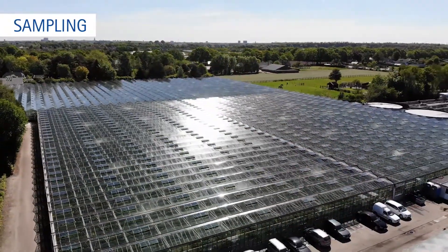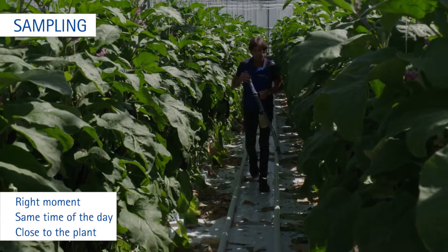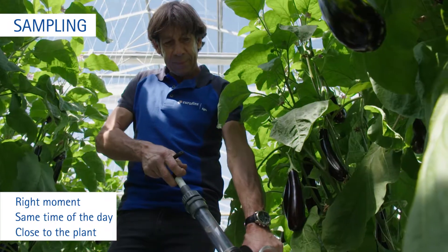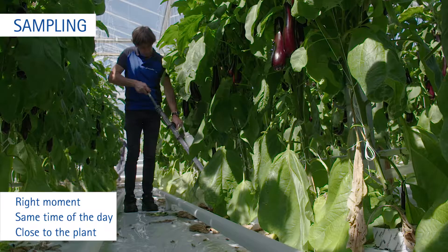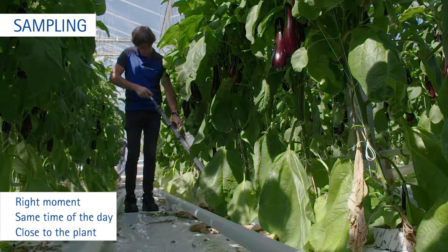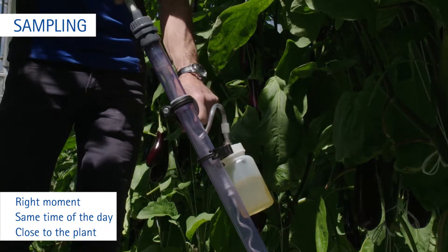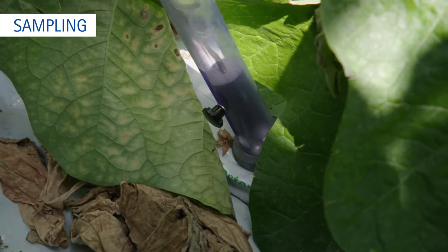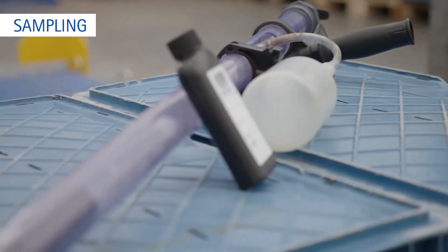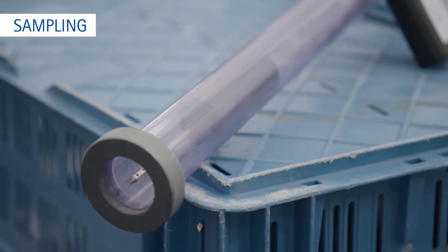Choose the right moment to take the sample — after a couple of irrigations and between two irrigations. Always take the sample at the same time of day, preferably before noon. Take a water sample as close to the plant as possible, preferably within a distance of 10 cm from the dripper, in the root zone. Use a water sampler if possible. If you do not have this instrument, you can use a syringe.